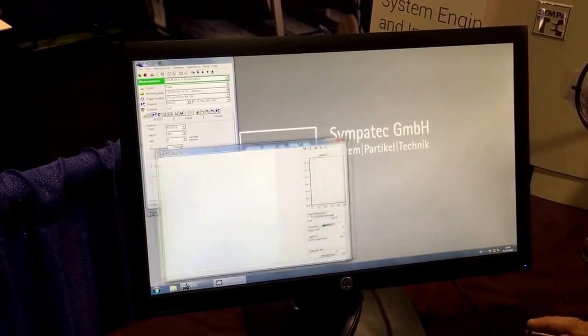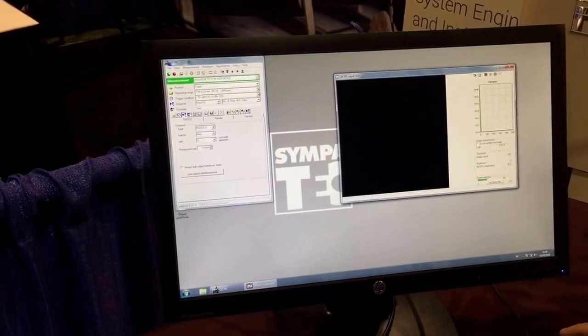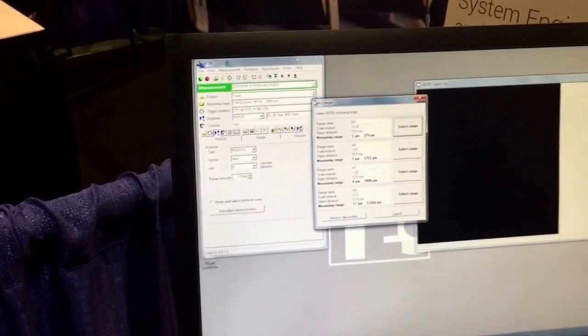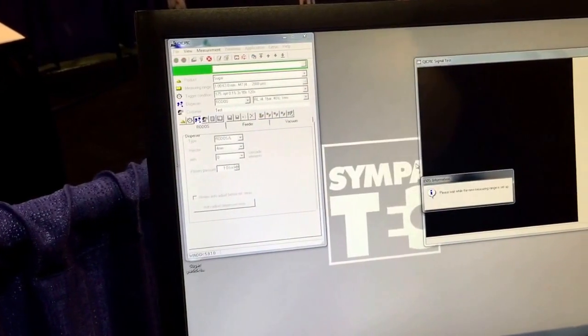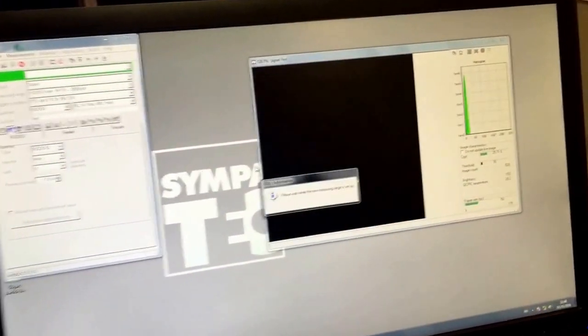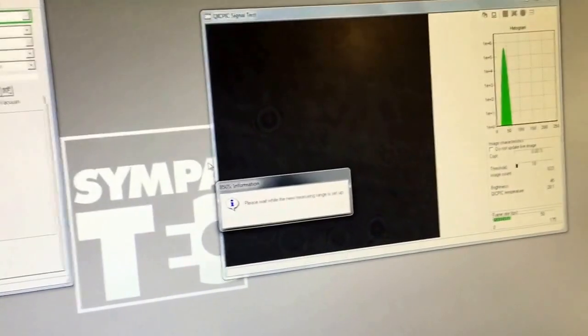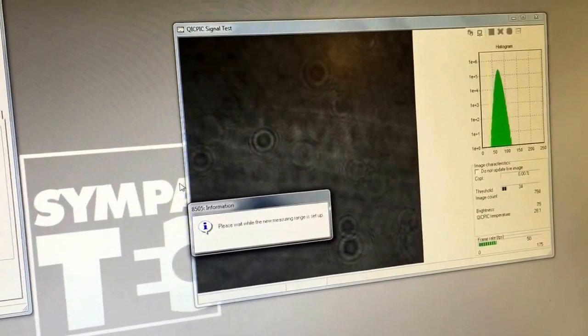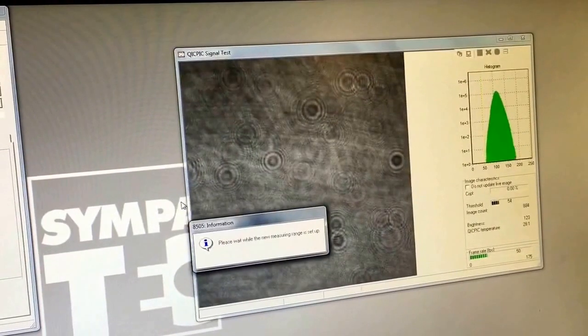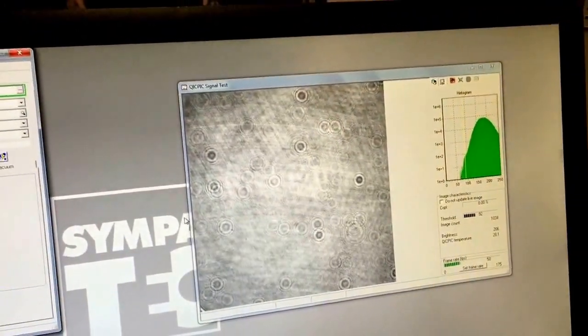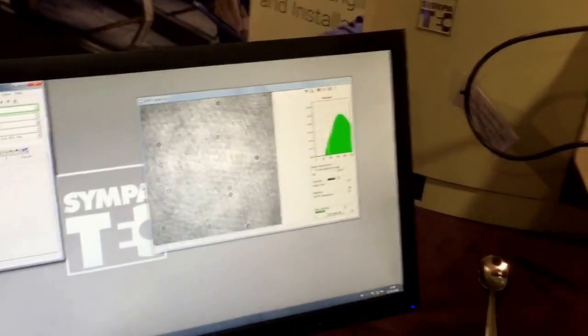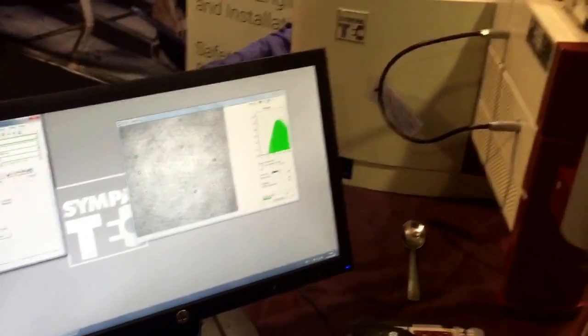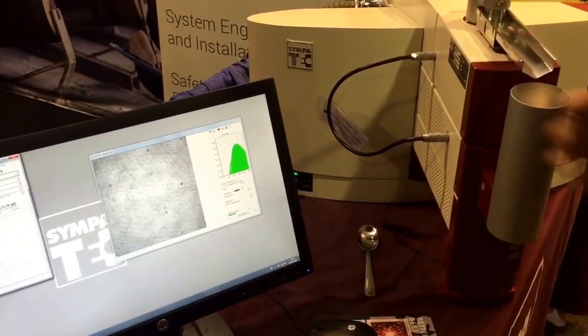We'll come over here, this is the window. In this case we're using the M7 range. There's a series of lenses in here, so this is like a microscope, except that the particles are moving. One of the reasons we developed this system was to overcome some of the limitations of microscopy.